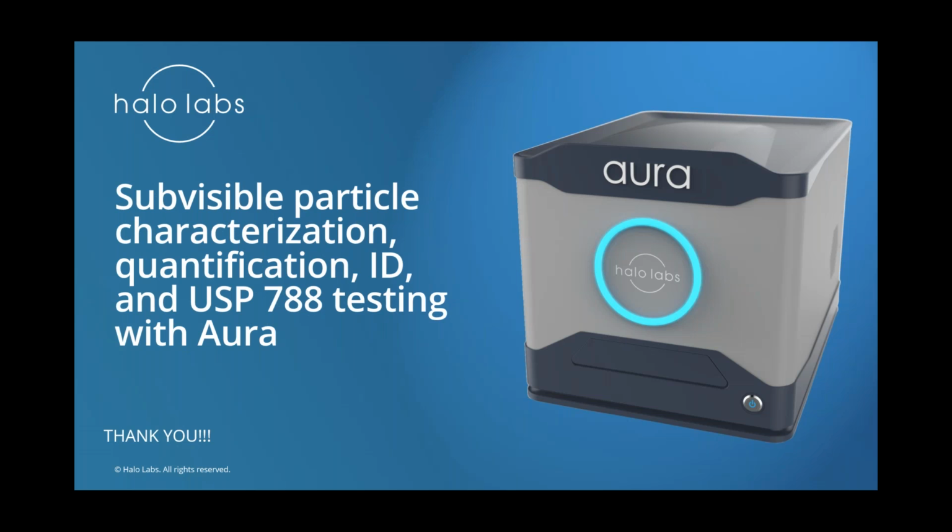Another question along the lines of filtration is, what is the vacuum pressure that we typically recommend? I believe the default vacuum pressure is 45 kilopascals, which is a little bit under half an atmosphere. So you have the arrow pointing at around 85 on the regulator, but it's 45 kilopascals. Yep. Great, thank you very much.